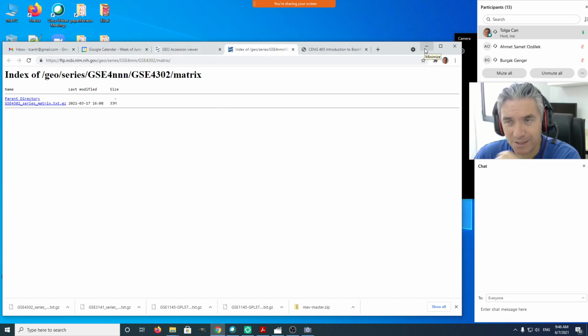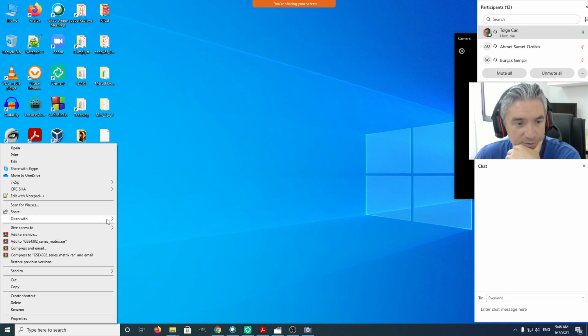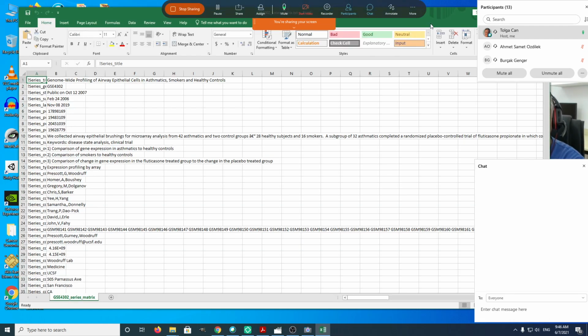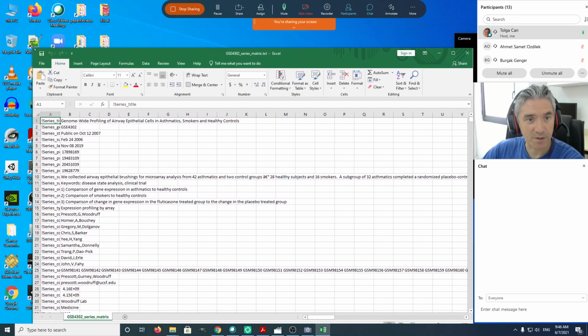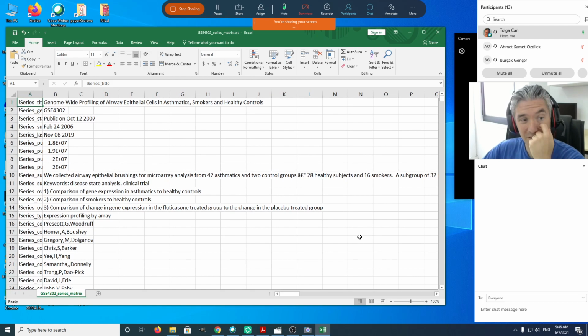So last time we opened it in Notepad++, which we were not able to browse effectively. But you can open this after you unzip this zip file. You can open it with Excel, or any spreadsheet program which can read tab-separated files. So after we open this, let me zoom in. Let me make this a little bit smaller so it fits on my screen. Okay, and also let's zoom in on this.